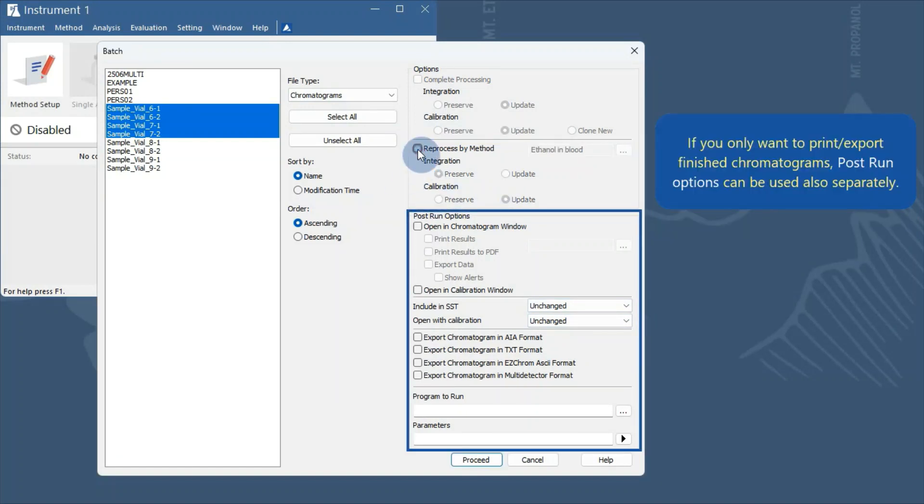If you only want to print or export finished chromatograms, post-run options can also be used separately.